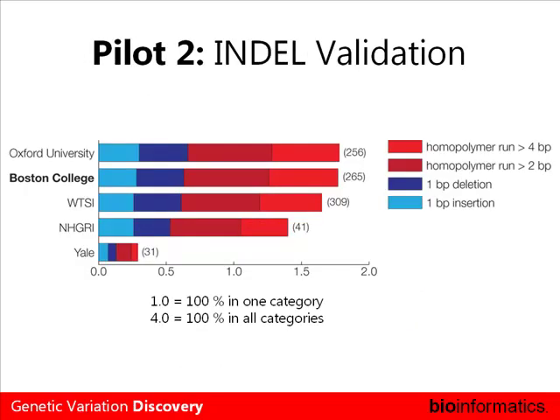Another thing that I did a lot with is making indel calls. And what we see here is it's kind of a weird way of showing it, but when they validated these insertion deletion events, they categorized them into four different categories. Homopolymer runs that are longer than four bases, another one that's longer than two bases, and here's just simple one base pair insertions and deletions.